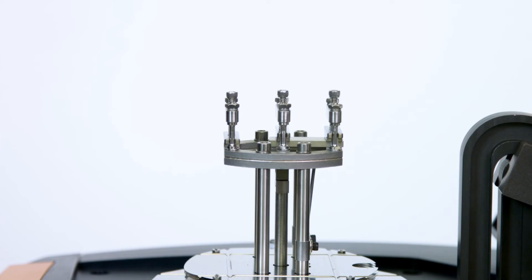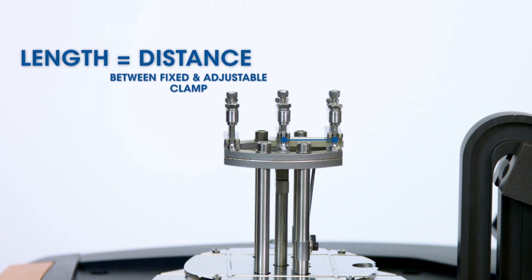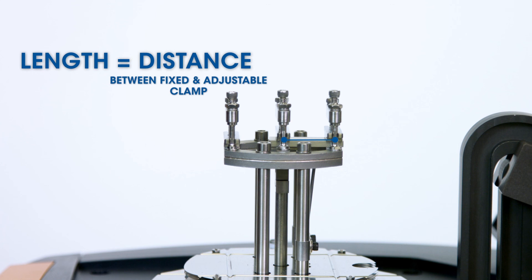Please note that when using a single cantilever clamp, the length of the sample is the distance between the fixed and the movable clamp. You should measure the actual sample length after you load the sample to the clamp.